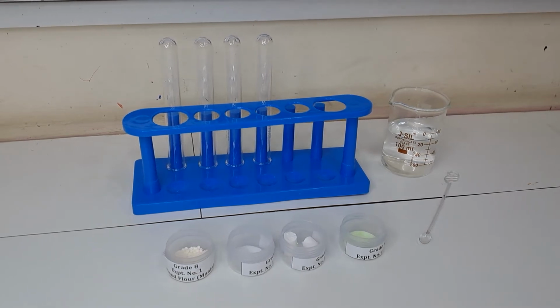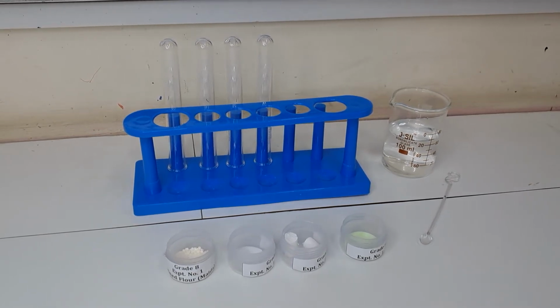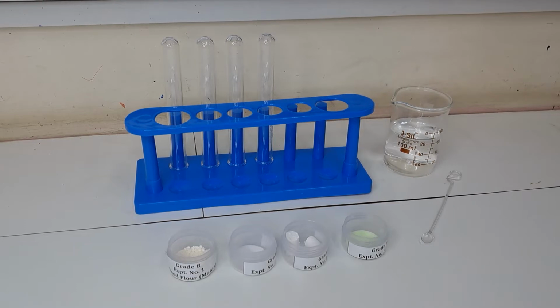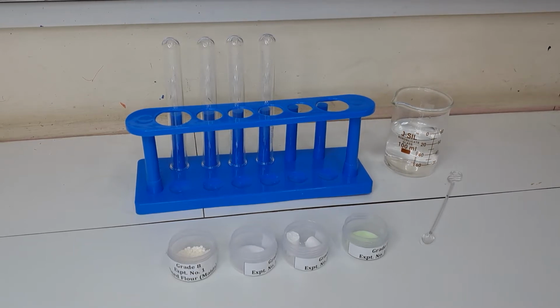Hello student, we are going to perform experiment number 1. The aim of the experiment is to observe the interaction of different substances with water.